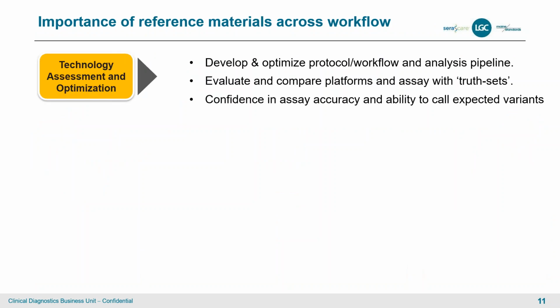So why are reference materials important? Right? Stop and think about the workflow as you go from development into an assay launch, right? In the very beginning, you're spending a lot of time pondering, am I really picking up the best technology? Am I developing and optimizing the right protocol, right? And the analysis pipeline, right? It's obviously a lot of choices. You have different instrumentations, different protocols. How do I evaluate and compare platforms and assays? And we feel these truth sets, as we call them, the reference materials, are a very critical player in the beginning. Okay? If you don't know what you're getting, how are you going to proceed with the assay?